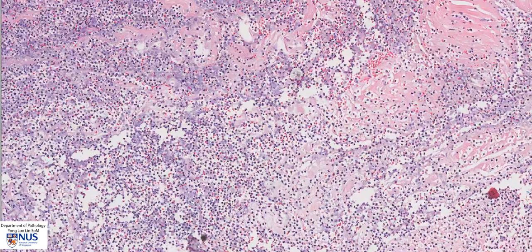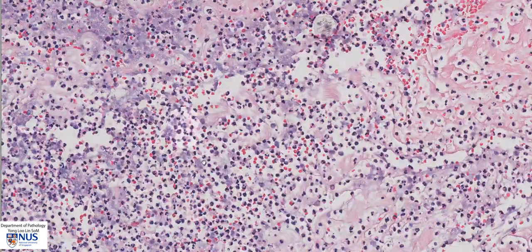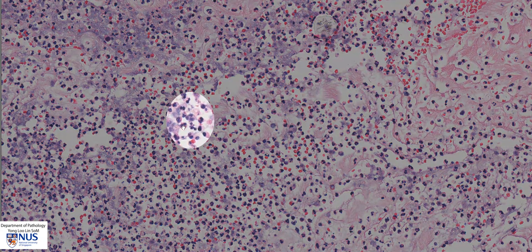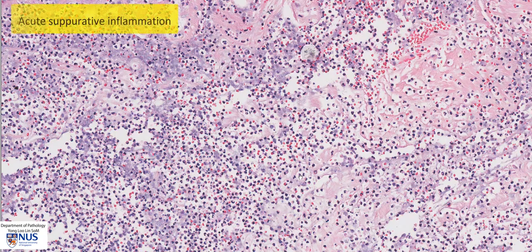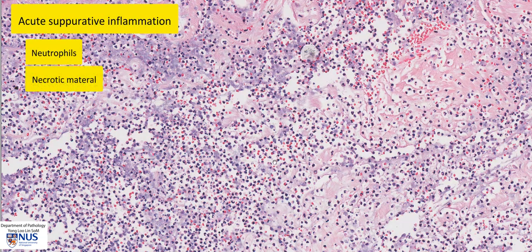We can see that most of the cells are neutrophils. We can appreciate the multi-lobed nuclei, and there's some bluish and pinkish necrotic material in between. Essentially, acute suppurative inflammation is composed of numerous neutrophils, necrotic cellular material, and sometimes we can also see the offending infectious agents. In the case of a furuncle and a carbuncle, one of the commonest infective agents is the bacteria Staphylococcus aureus.